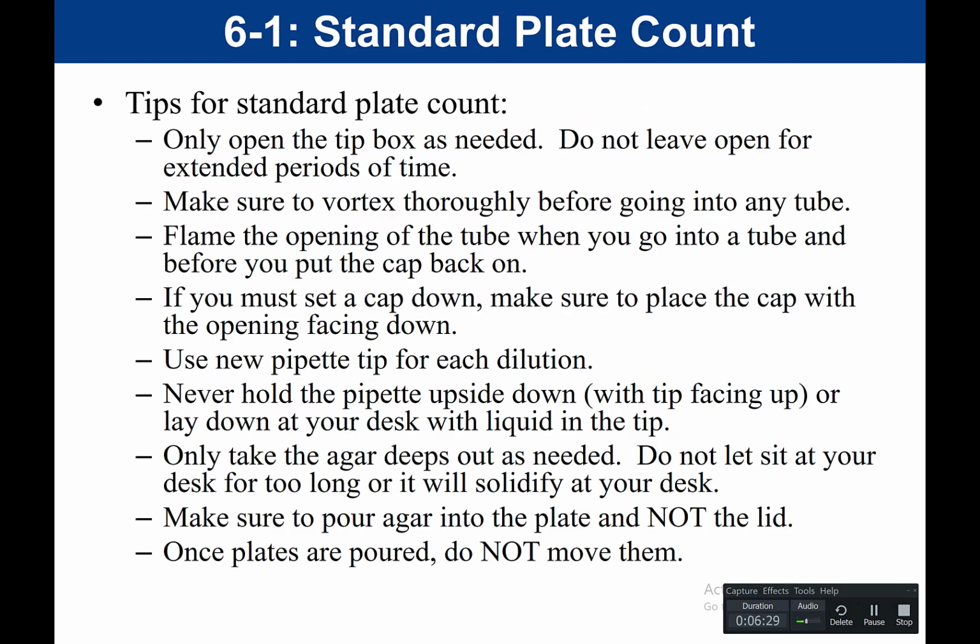You should understand the general rules for how to do a standard plate count. So what are the things that you should do to maintain your aseptic technique? Just review these to have an idea of what to do.